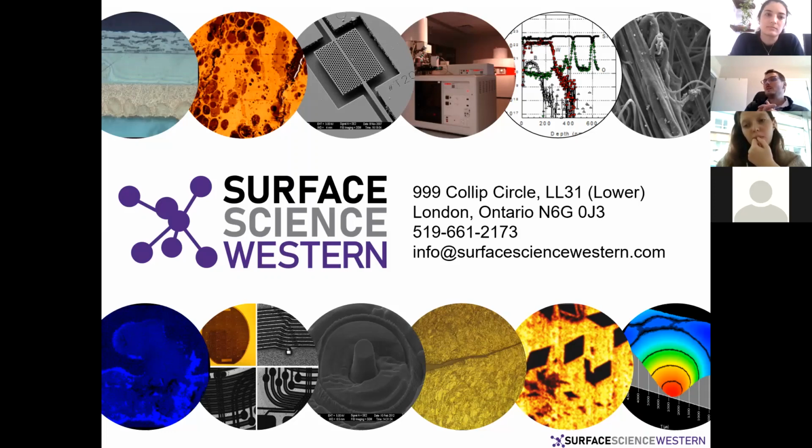Some samples are really delicate and they don't last under the X-ray beam; they'll degrade, or the action of the charge neutralizer will cause them to degrade. You get thermal effects. Something like copper 2 hydroxide, you put it under an X-ray beam and it reduces very quickly to copper 1, just from a thermal effect because the X-rays heat that material up. So you can cool the sample with liquid nitrogen attachments that cool the stage and the sample, which allows you to analyze it. Polymers can do the same thing. Most of them are pretty good, but I've seen some delicate stuff where you can almost see it melting and burning within the instrument, discoloring as you hit it with X-rays. So degradation of the materials under the X-ray beam can be an issue.